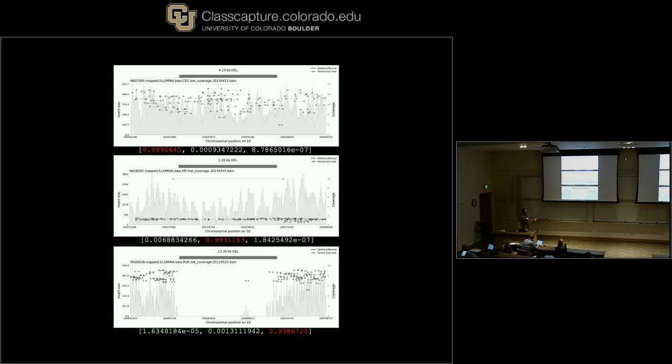So you see here the top one, the highest value 0.999, corresponds to no copy loss, which I think we can all agree is the state there. And then you have heterozygote loss, and you have homozygous alternate, which is 2 copy loss, in the bottom one. All right, so this is really quite exciting. It takes a millisecond or so to take an image, run it through our model, and get a prediction back out. But it doesn't always work.